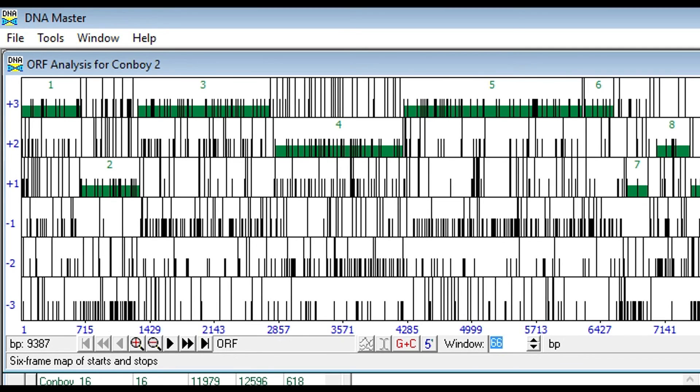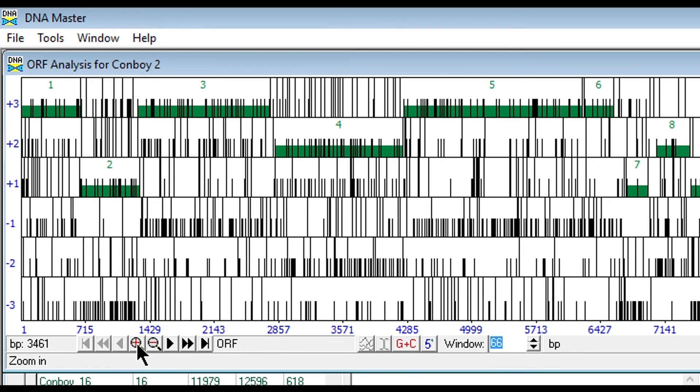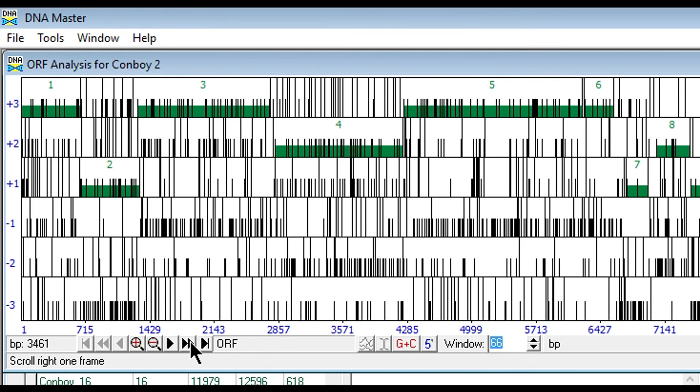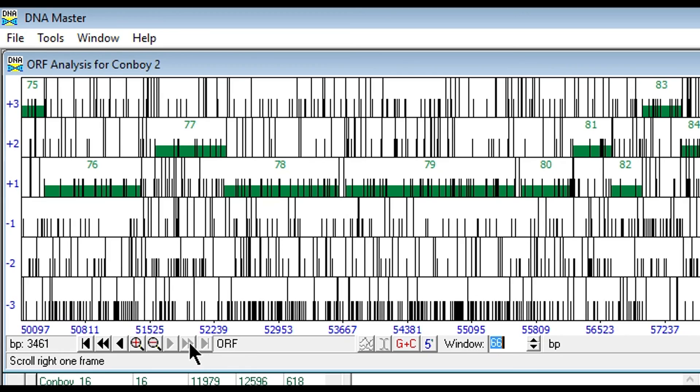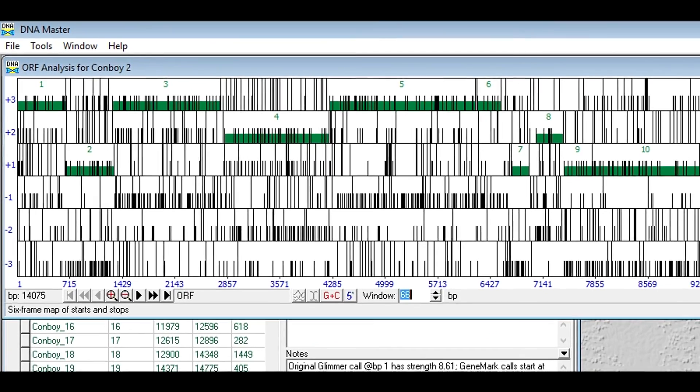Again, as we mouse through the genome, you can see in the bottom left-hand corner of this window, the base pair number corresponds to wherever your cursor is. That might be useful in locating a specific base pair coordinate. Also, again, you can utilize the zoom in, zoom out, and pan across the genome to locate the gene that you're looking for.